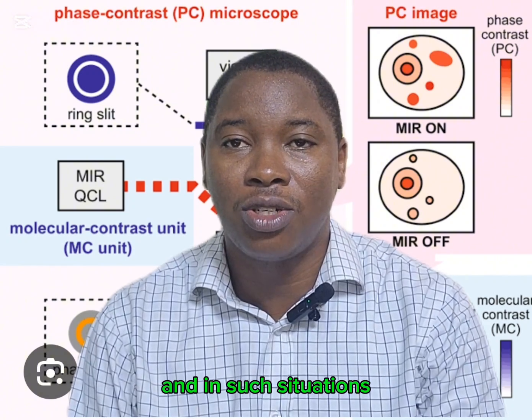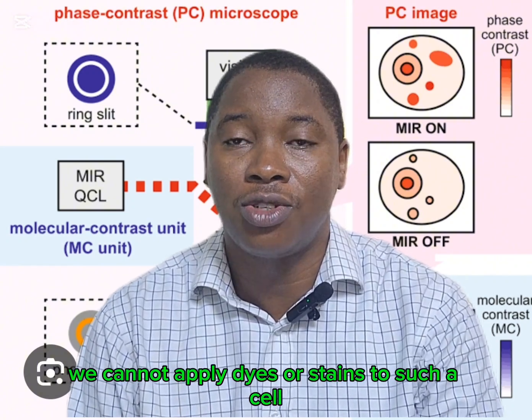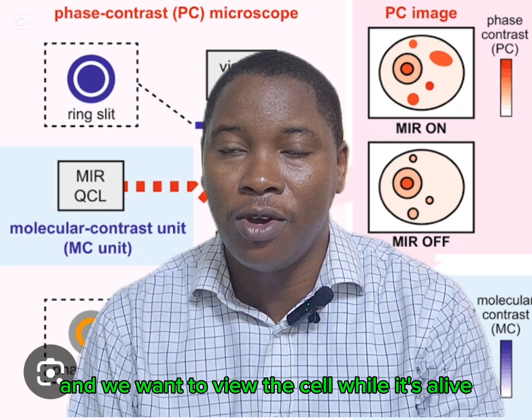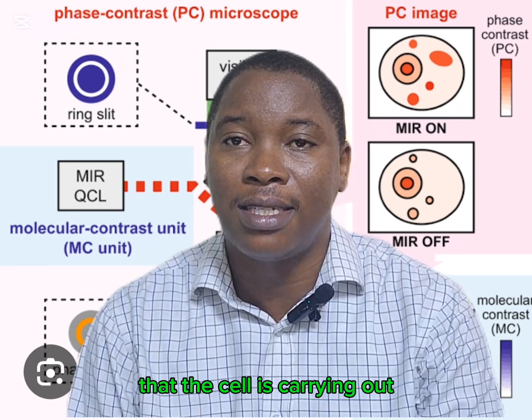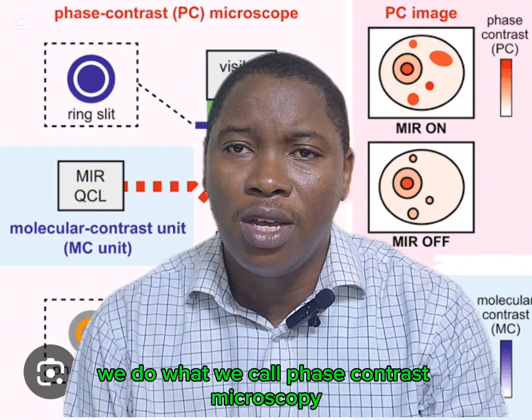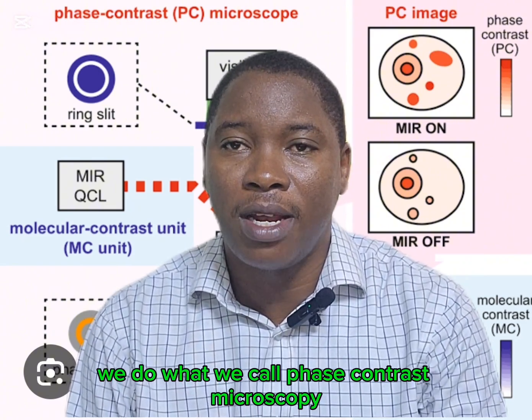And in such situations, we cannot apply dyes or stains to such a cell because that will kill the cell. We want to view the cell while it's alive. We want to look at some of the activities that the cell is carrying out even while it's living. So in order to do that, we do what we call phase contrast microscopy.